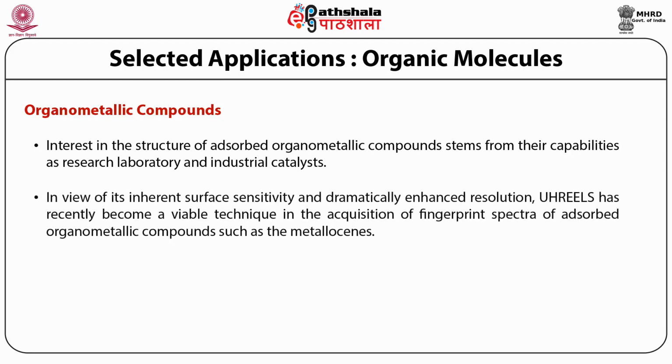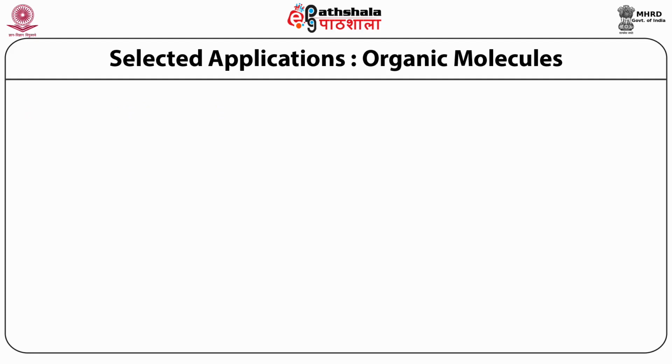In view of its inherent surface sensitivity and dramatically enhanced resolution, UHREELS has recently become a viable technique in the acquisition of fingerprint spectra of adsorbed organometallic compounds such as the metallocenes.